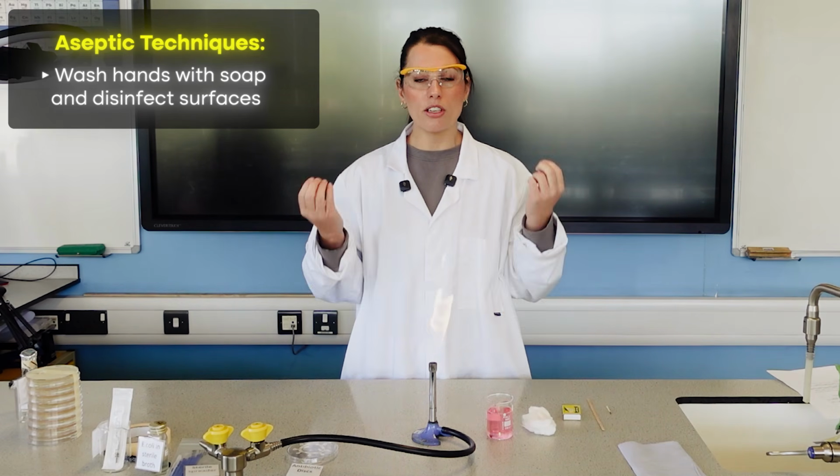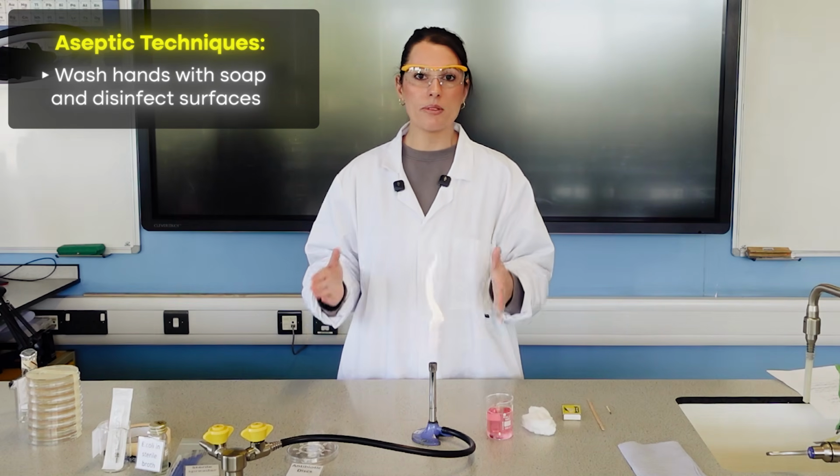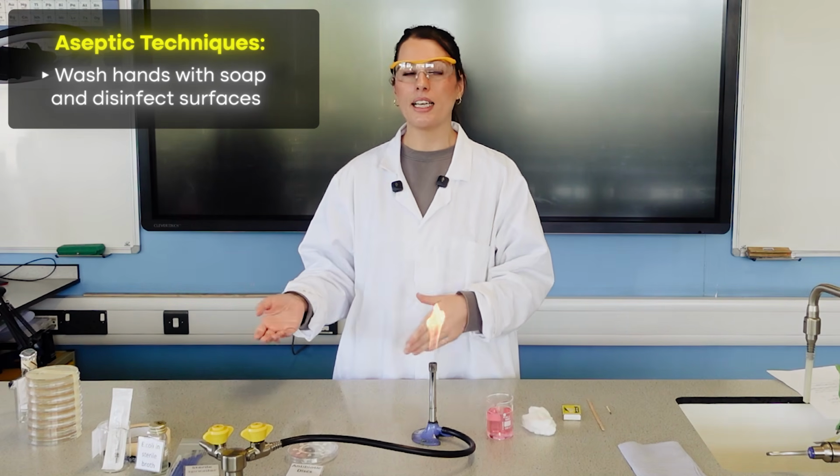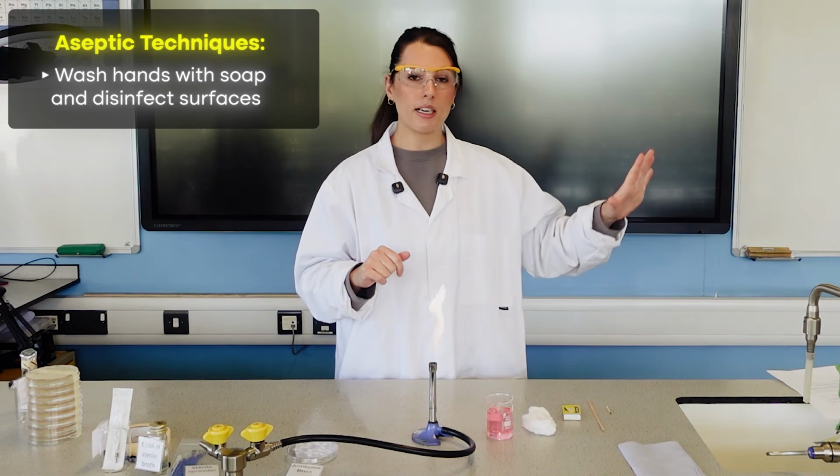The reason for those is you need the soap or the disinfectant to actually kill and remove other microbes that could contaminate your plate. And in terms of at the end, it's to kill the bacteria you've been growing so you don't then spread it across the school.